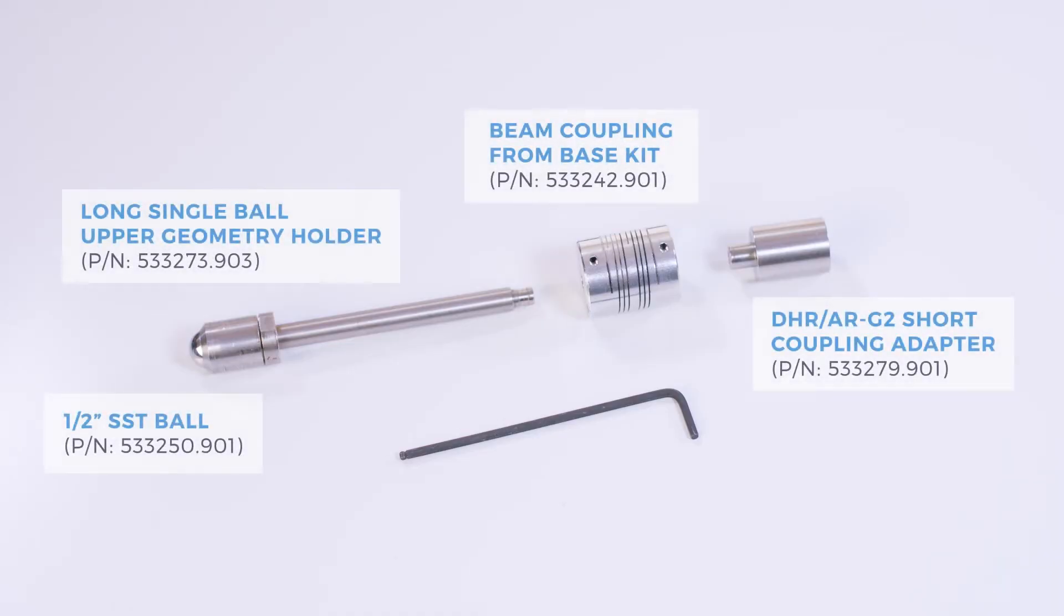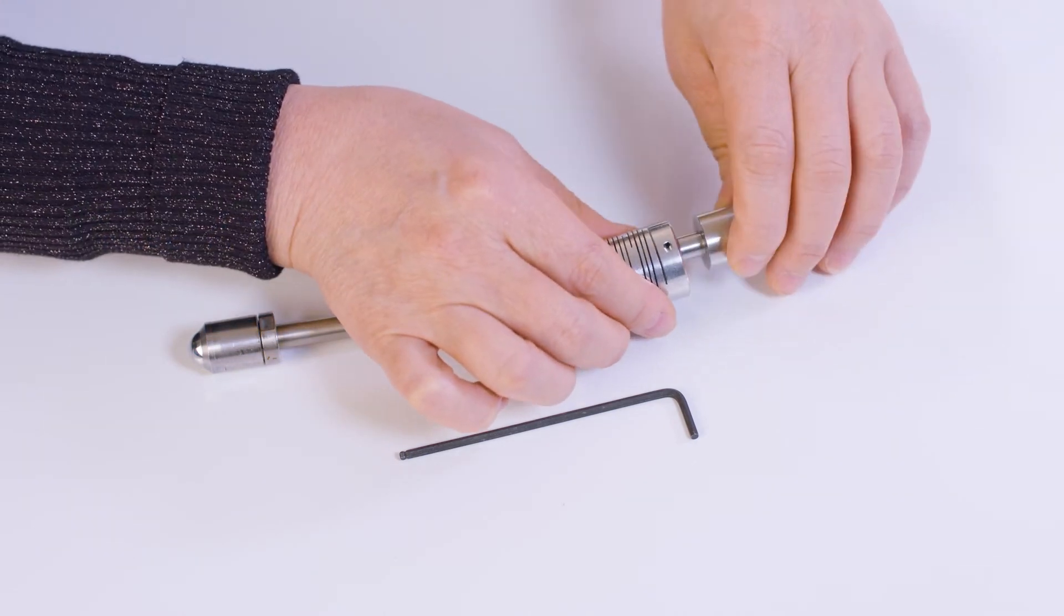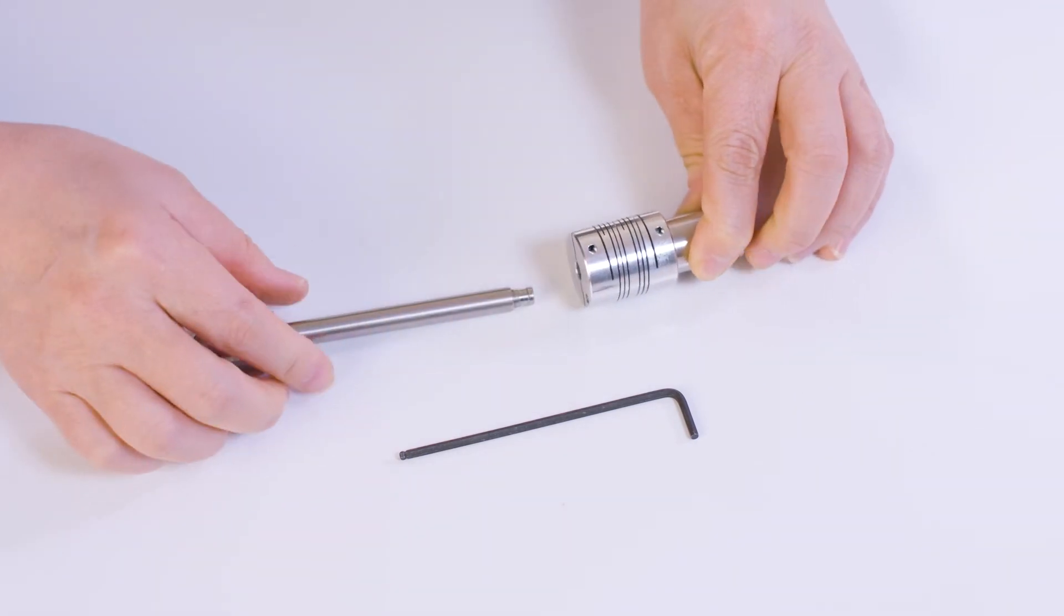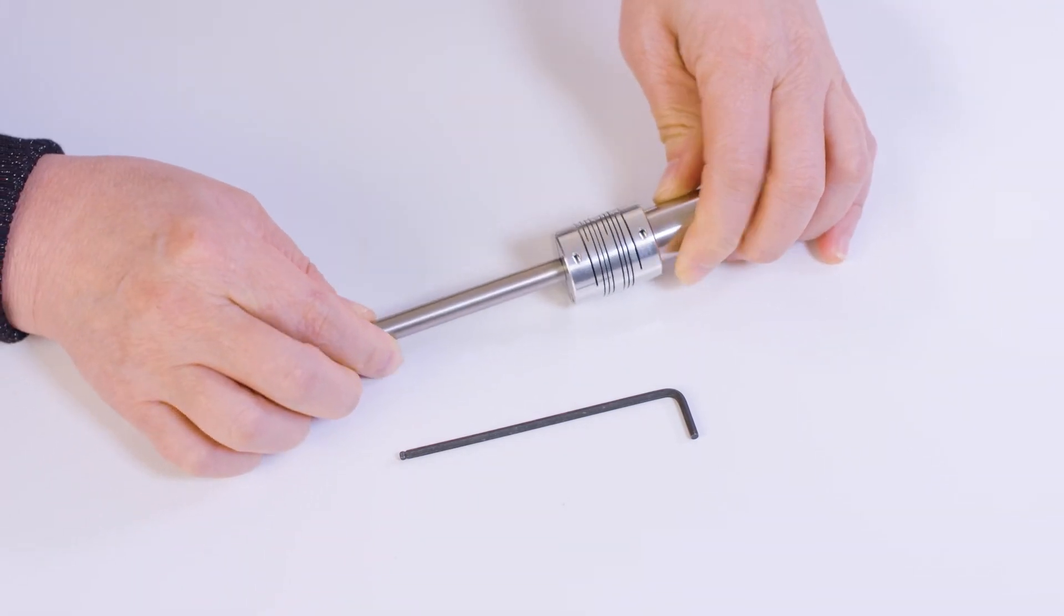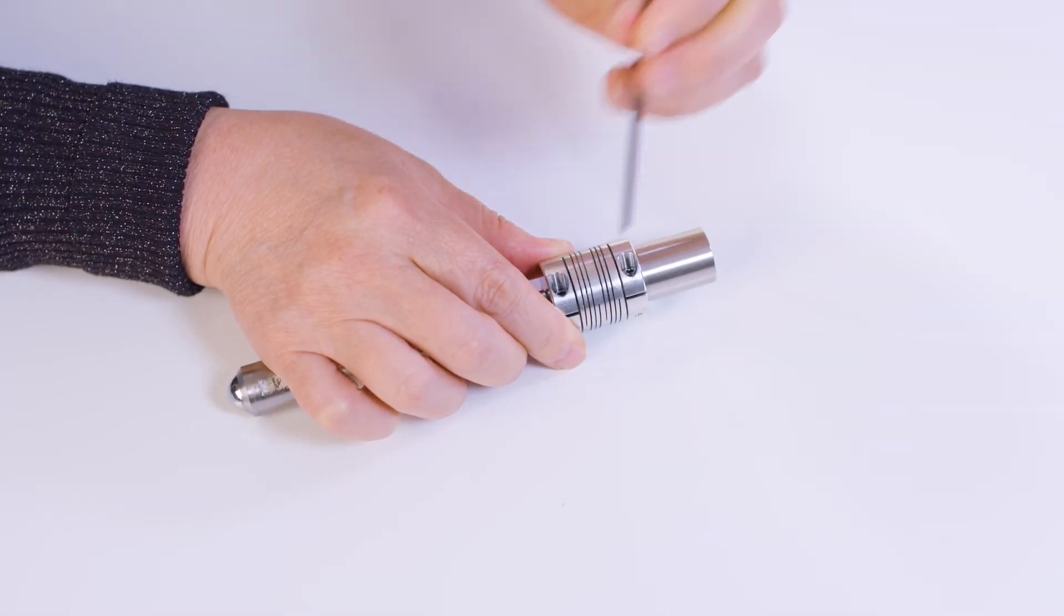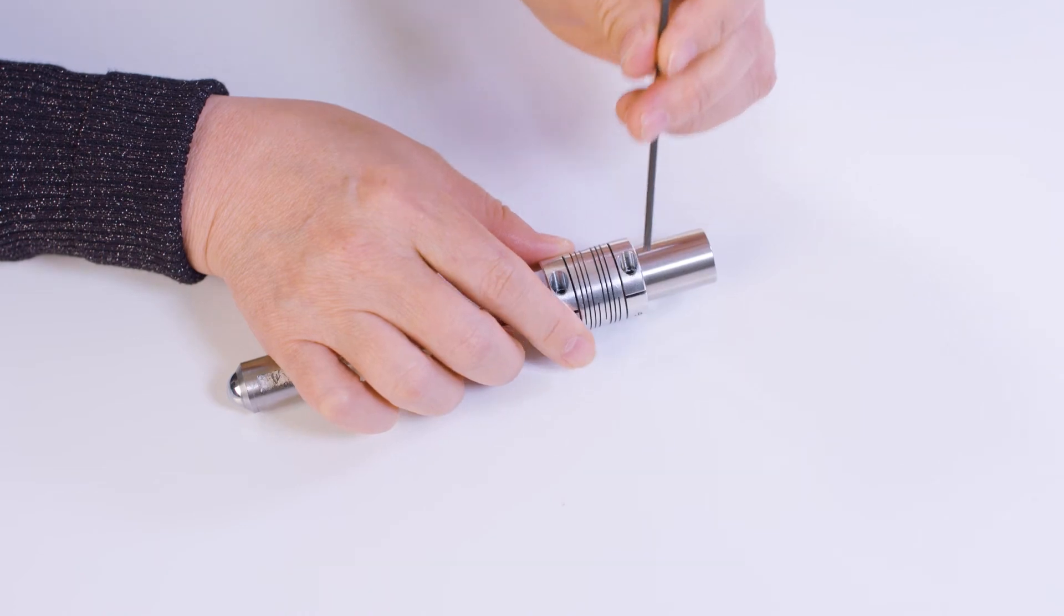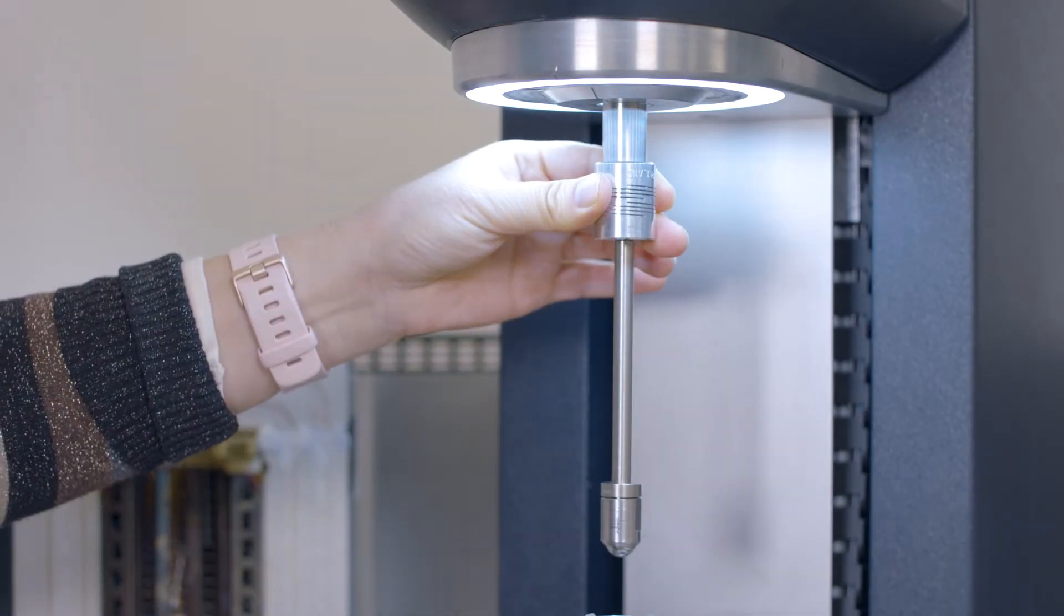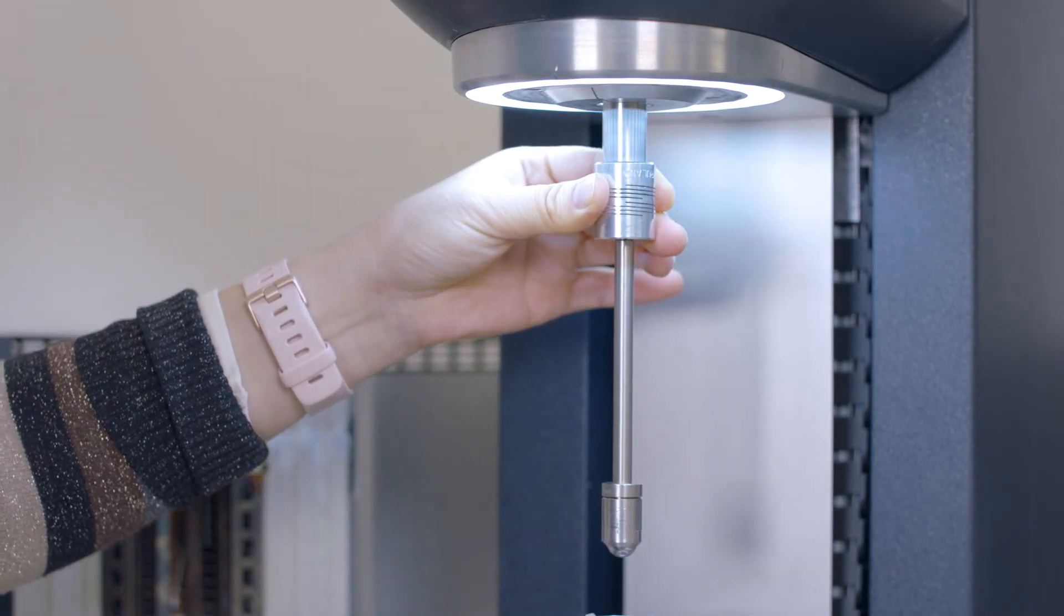For the top fixture, you will need to use this short coupling adapter. Insert the beam coupling, and then attach this long single ball upper geometry holder with a half-inch ball in it. Tighten the screws on the side. After that, install this upper geometry to the top of the rheometer.